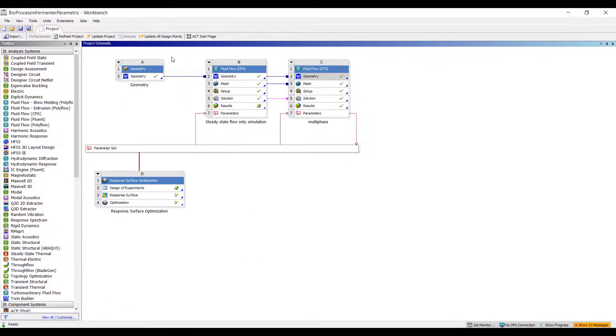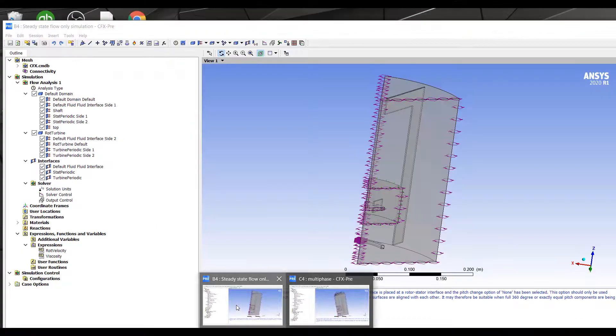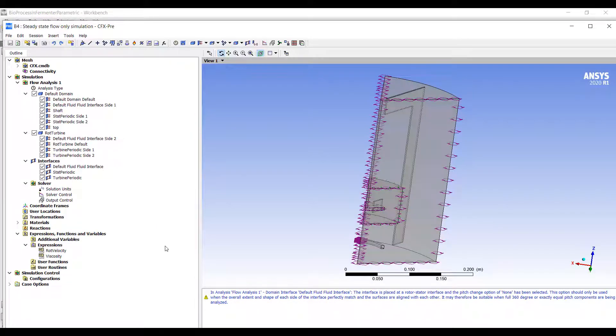You can see we have a steady-state simulation followed by a multi-phase simulation. I've parameterized the entire analysis and we've done a response surface-based optimization. This is all inside ANSYS Workbench. Let's take a look at what I did in the analysis.